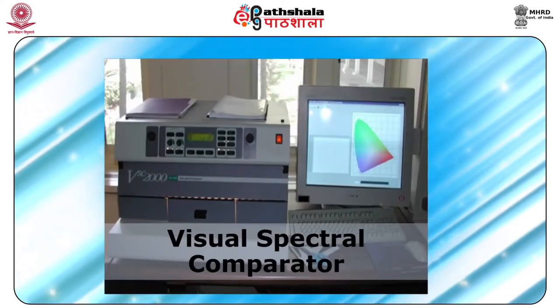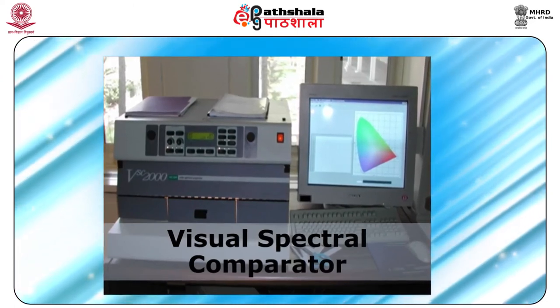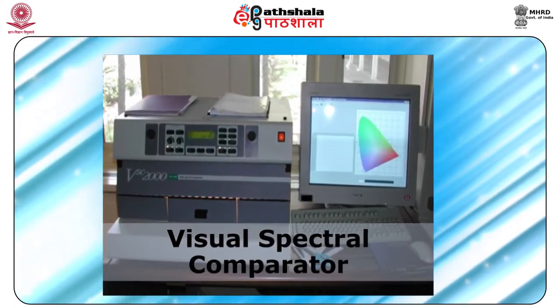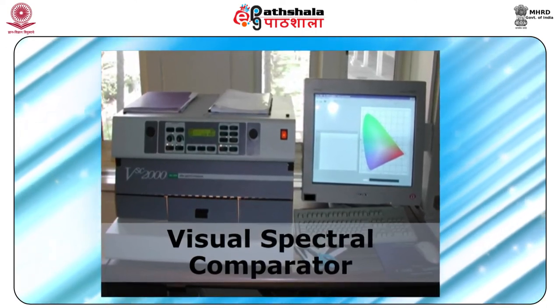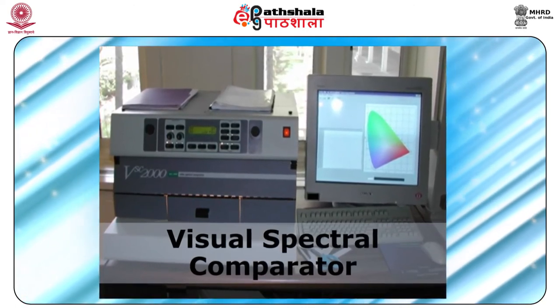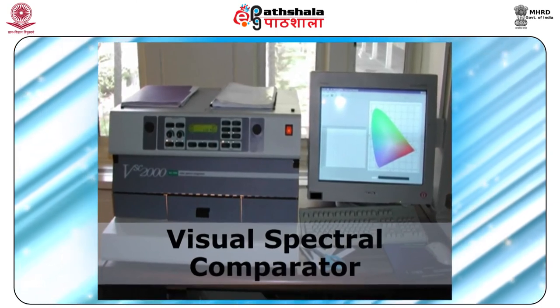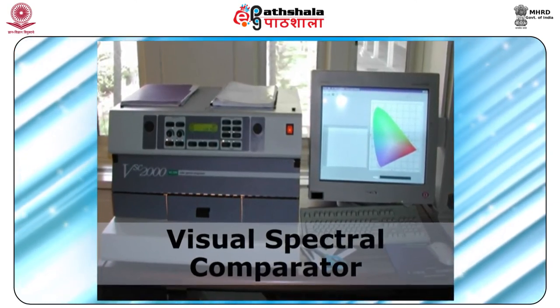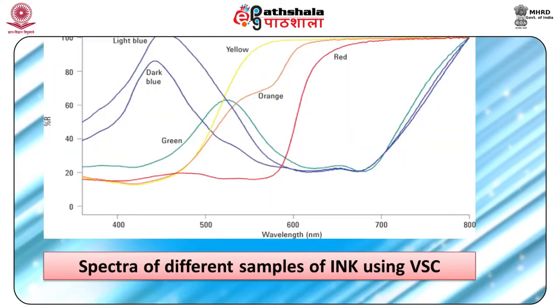The VSC is the most suitable instrument for examination. It is inbuilt with a spectrometer so that examination by means of absorption spectrometry in visible and infrared light can also be carried out.